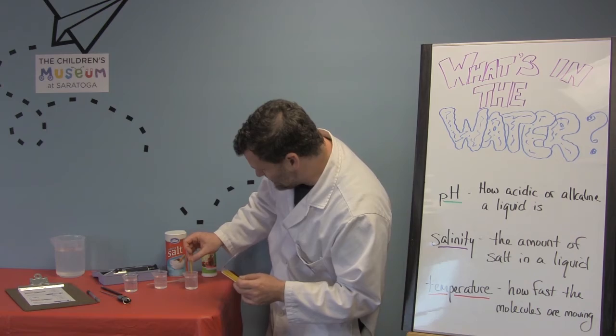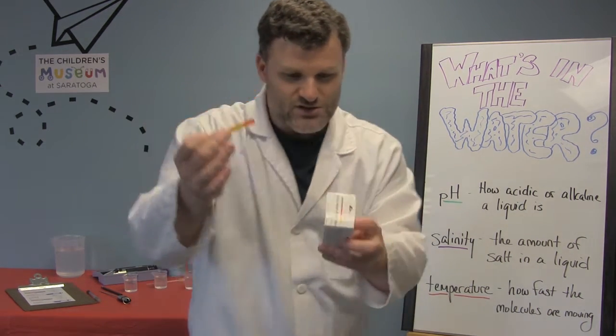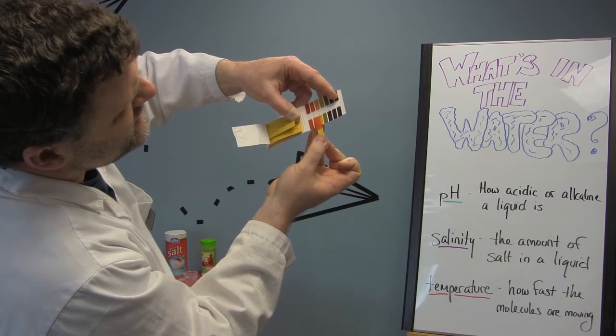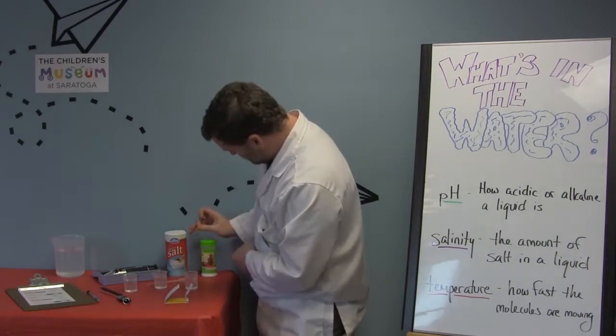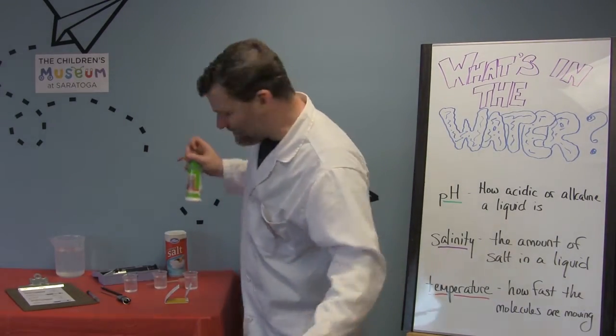So check that out — I put my strip in there and as you can see it turned orange from yellow. Now I can check on my little key here and it looks like it's really close to four. So I can tell that this is acidic because it has gone down, and neutral pH is around seven.